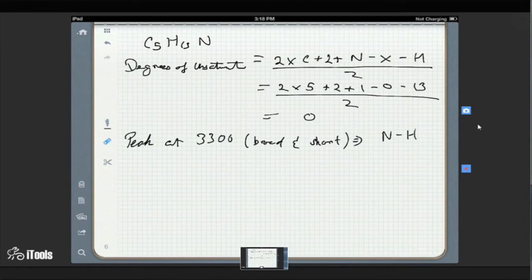That 9 looks like tert-butyl, because it's 9 equivalent hydrogens. Is that a doublet or a triplet? It looks like a singlet. Yeah, that would make sense. It's a singlet because it's not next to any other hydrogens.